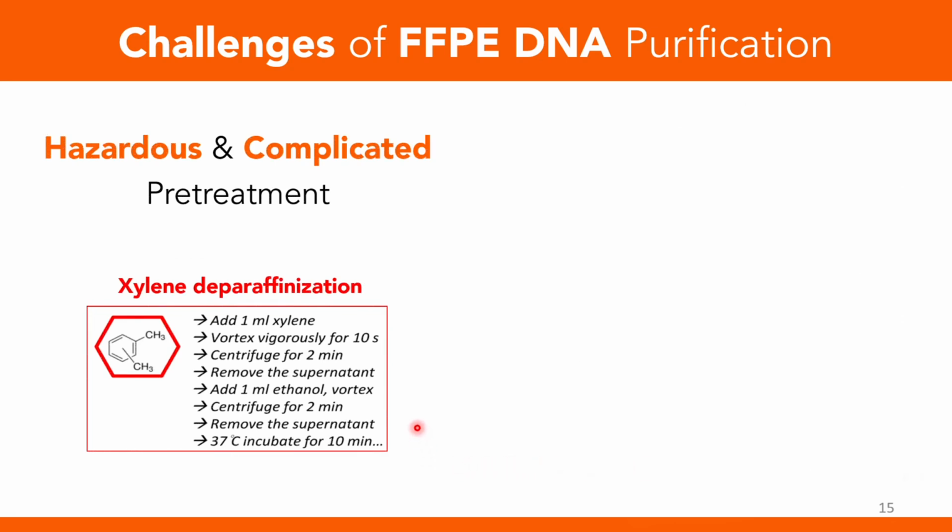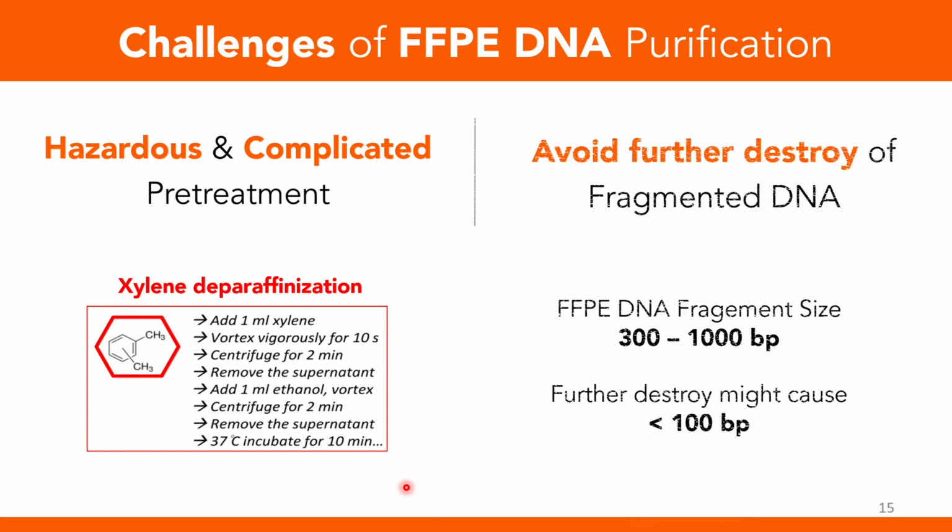One, because of FFPE, they need deparaffinization, and normally people need to use xylene, which is a hazardous chemical, and also the procedure is very complicated. It's a long procedure, so it's a hazardous and complicated treatment.